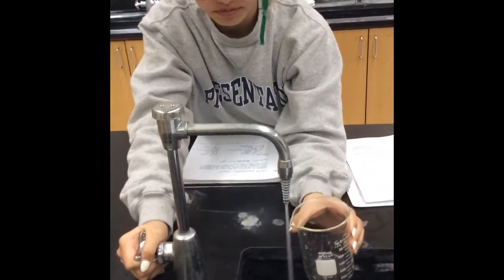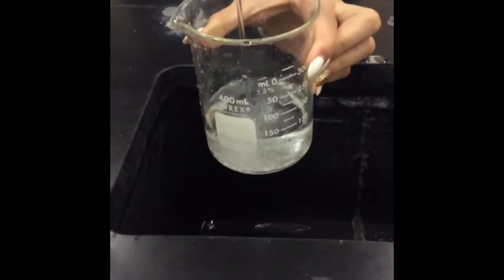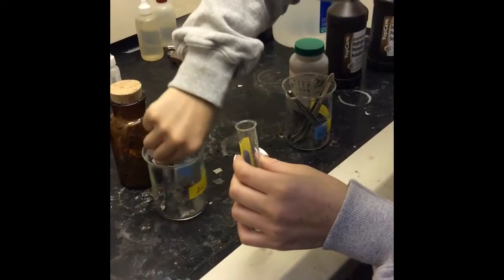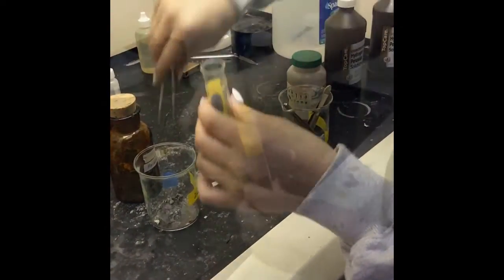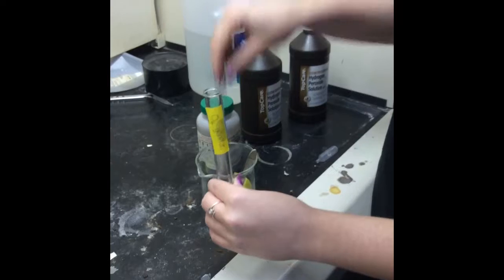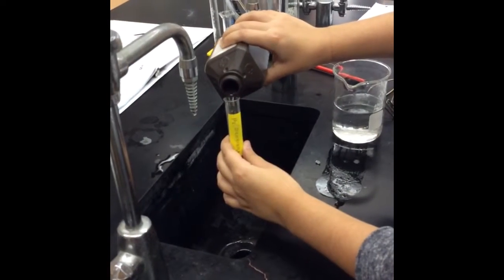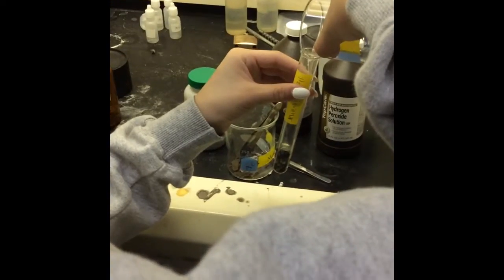First, we filled the beaker with 200 milliliters of tap water. We filled the H2 generator one-sixth full of zinc. Then we filled the O2 generator one-sixth full of manganese. We then filled the H2 generator with HCl and filled the O2 generator with H2O2.